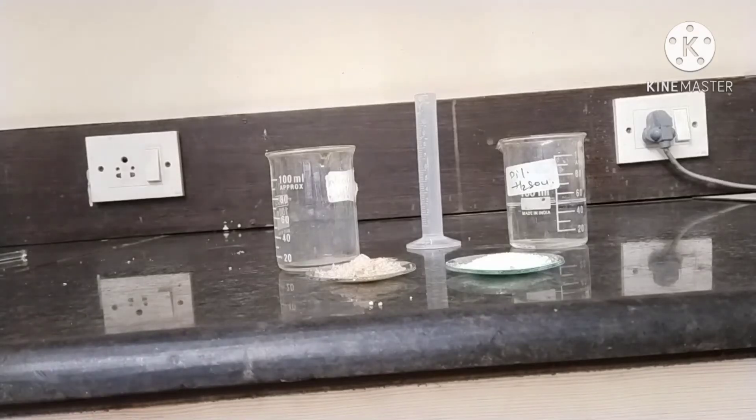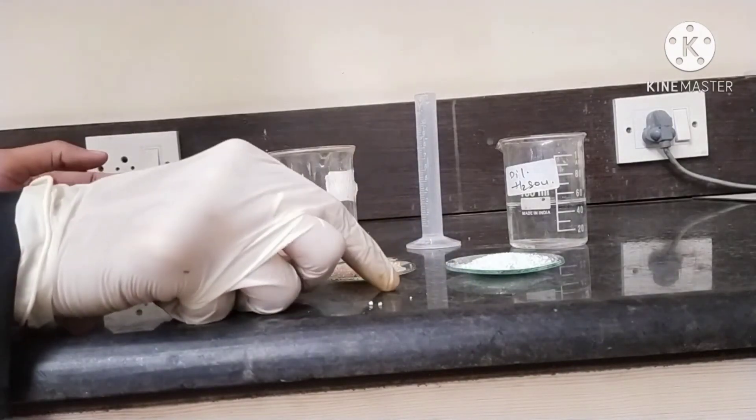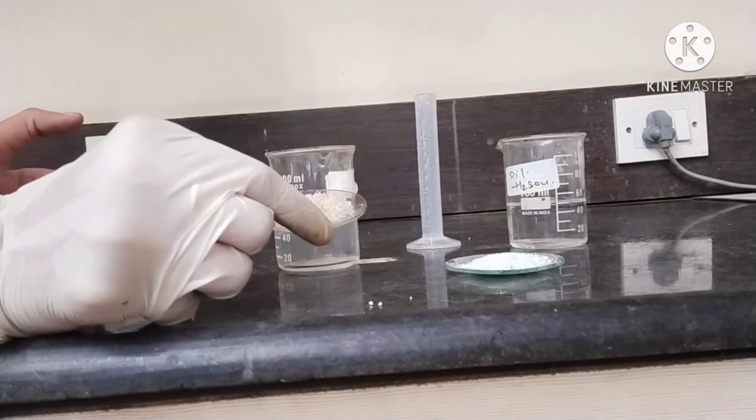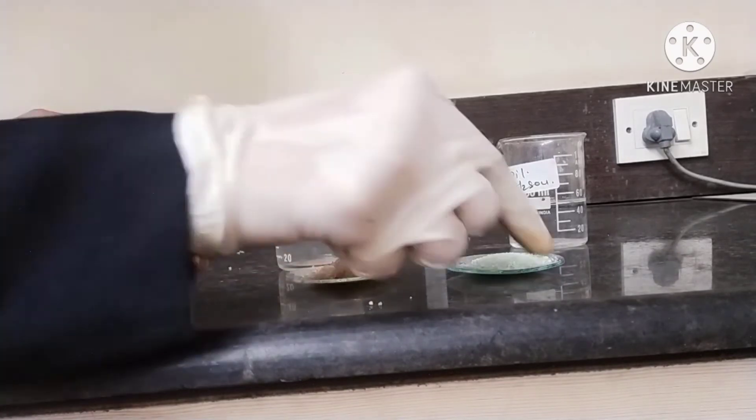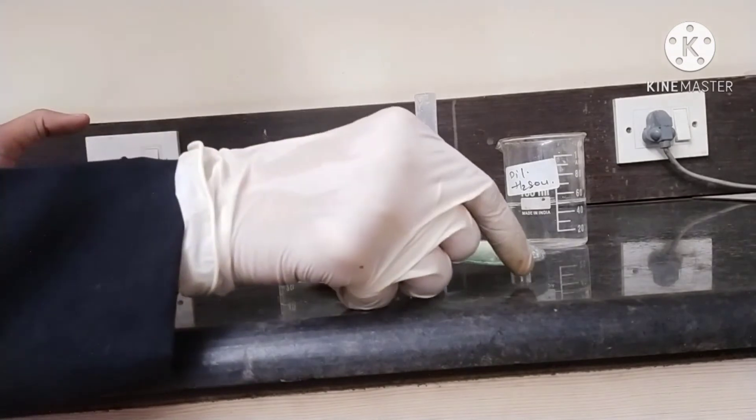Let's start the procedure. First, we have to take two watch glasses, then add 1.5 grams of ammonium sulphate and 3.5 grams of ferrous sulphate, which I already weighed in.